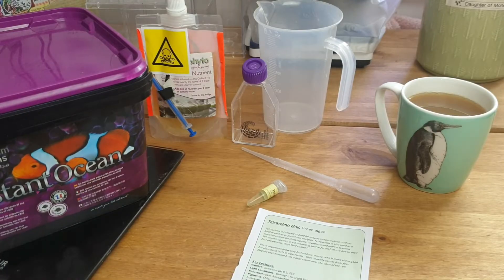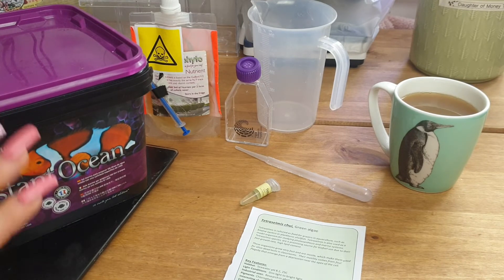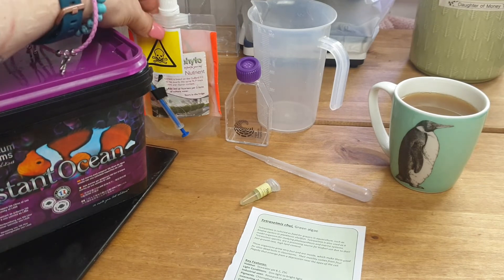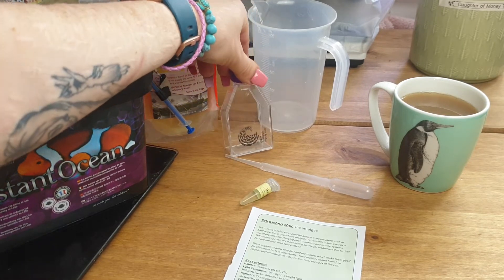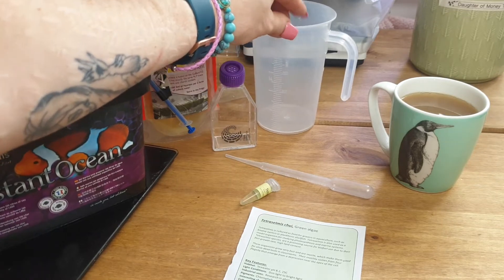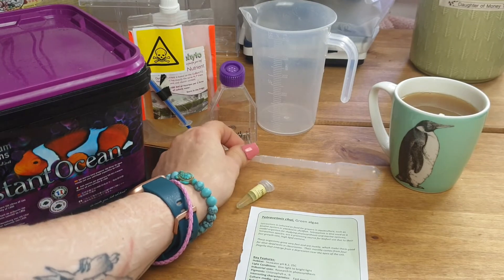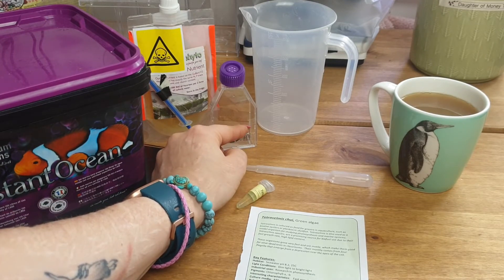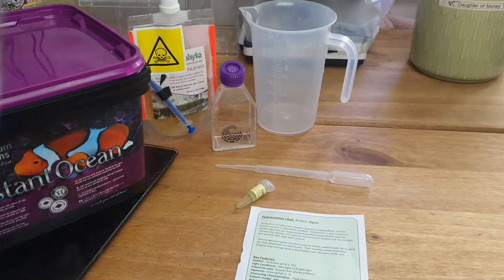Here is everything I need to set up the culture: I've got Instant Ocean reef salt, some weighing scales, the phytoplankton nutrient, a culture jar — you can use anything for this really as long as it's clean — a jug, the algae, a pipette for getting the algae into the culture jar, and of course a cup of tea. Cheers!